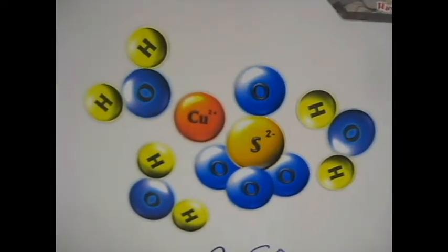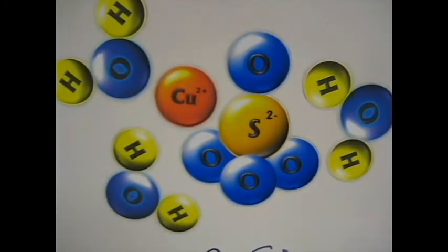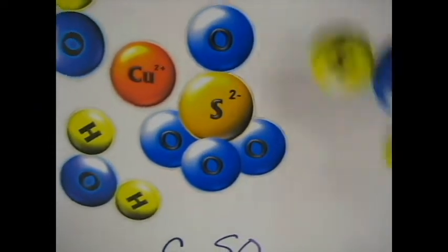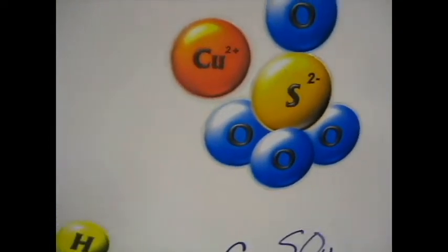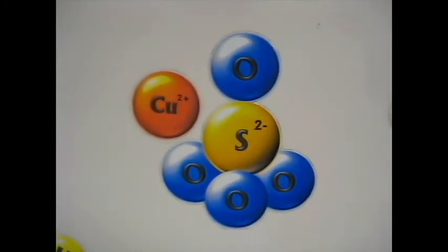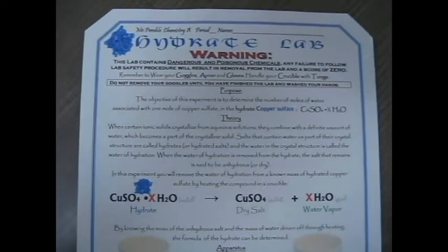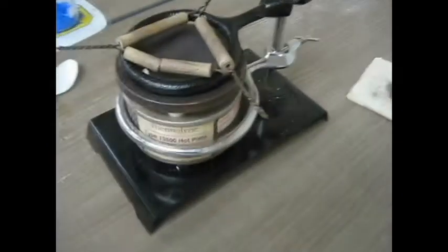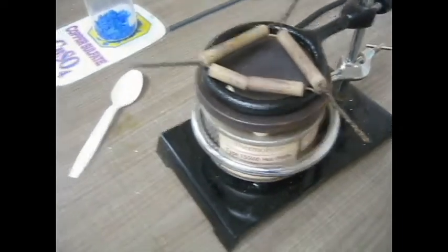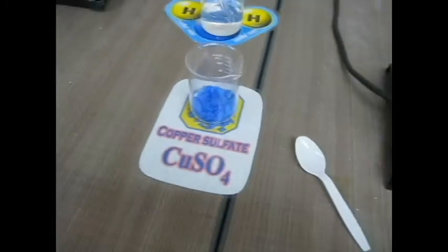So we're gonna take this chemical and be mean to it. We're gonna get rid of the water that is attached to it by heating it up on a hot plate, and the water is going to fly off, and then we lose that beautiful blue color. We are left with just a boring, drab, kind of off-white chemical, copper sulfate. Okay, the Hydrate Lab. Okay, I've plugged in my hot plate. It's gonna get hot. I gotta be careful with that. Okay, we're using this beautiful blue chemical, the copper sulfate. Okay, beautiful poster child for chemicals, and we're gonna destroy it.